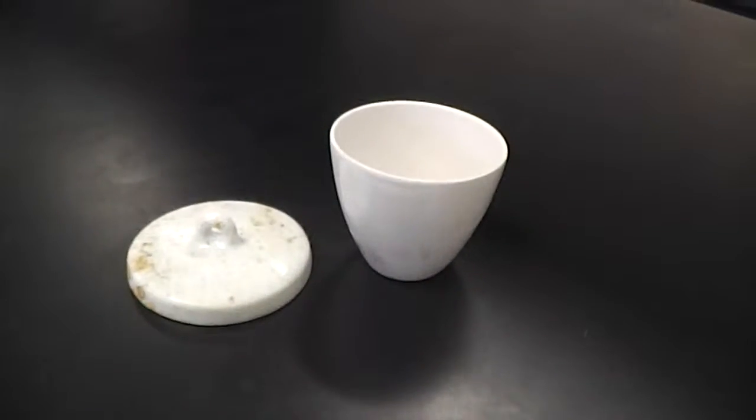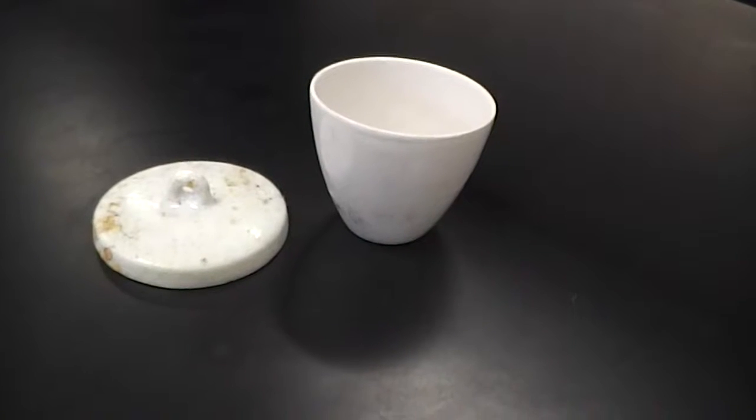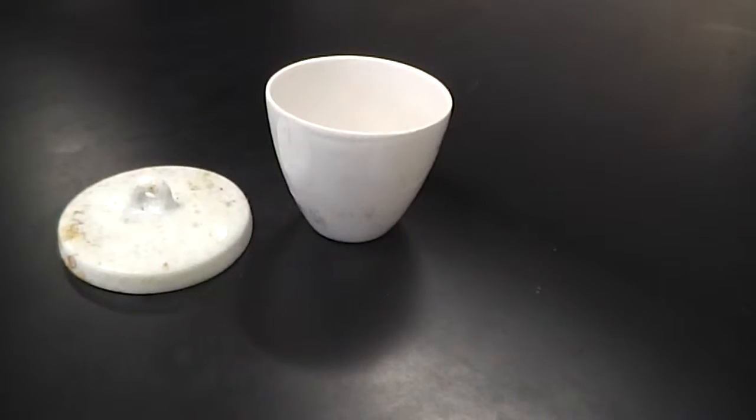A crucible is a small porcelain container with a lid. It is often used for drying excess water out of a chemical or just for heating substances.